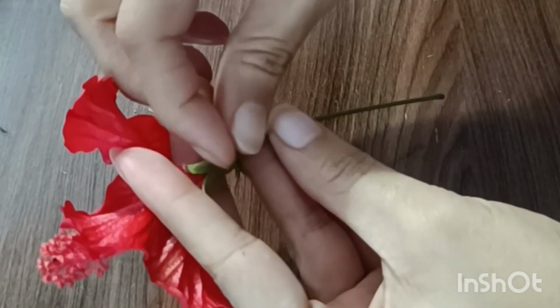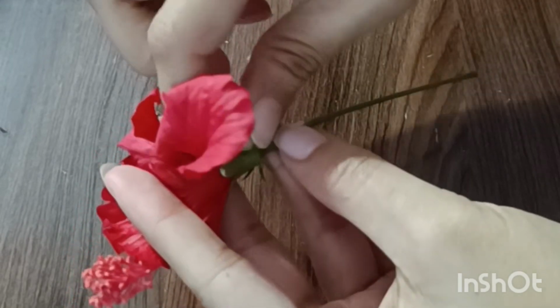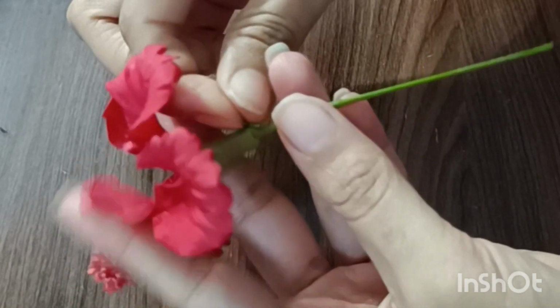Now I observe the epicalyx. It is present below the calyx. It consists of 5 to 8 green bracteoles. It protects the flower in the bud stage.